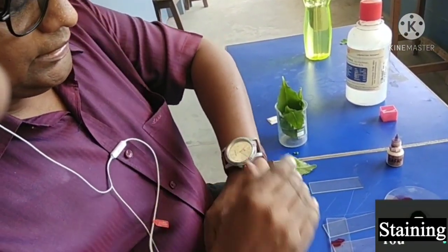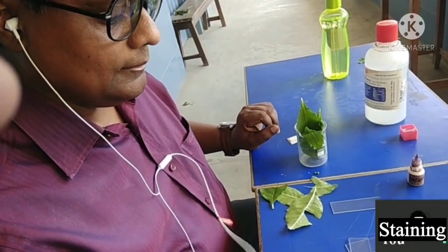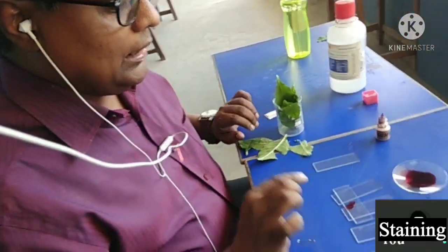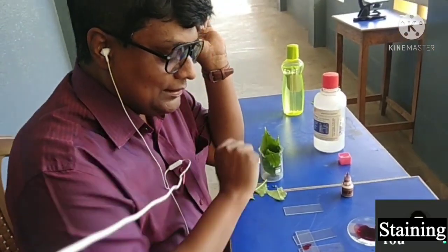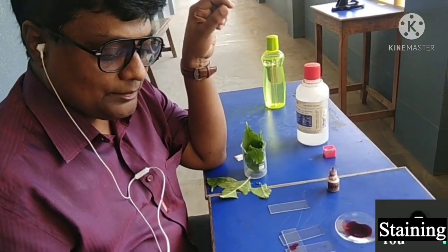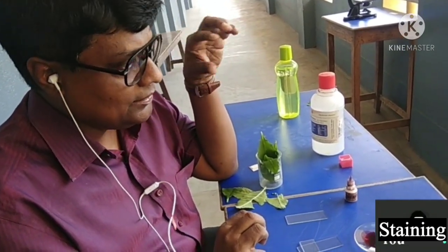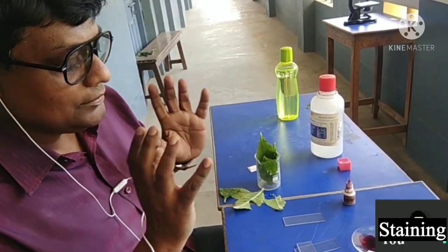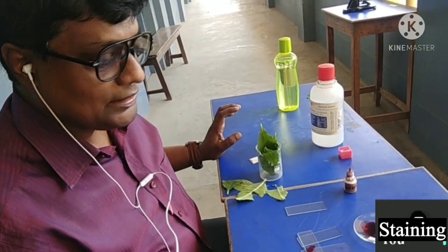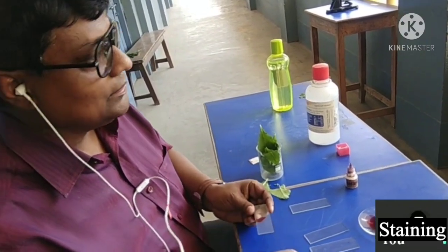After applying the staining material, we have to keep it for a few minutes — about one minute here because it is fresh material. The staining helps make structures clear and prominent. Especially for plant cells, the cell wall will be stained properly, and inside, the nucleus, guard cell, and chloroplasts will all be prominent in red color. Methylene blue can also be used, but here we are using safranine.